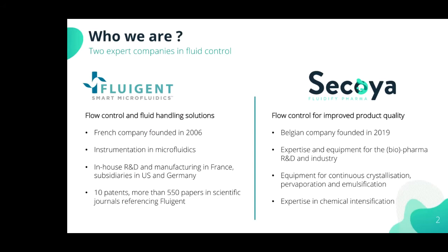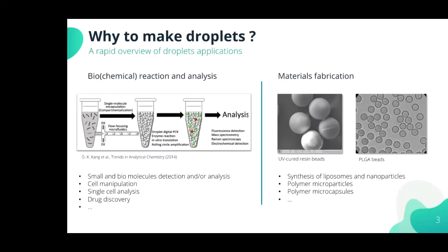But first, why make droplets? If you attend this webinar, you probably have an interest in droplets, and you probably have a specific application in mind. But each of you may have a different application, so I will just give you a rapid and non-exhaustive overview of such applications, sorted into categories: biochemical reaction and analysis, and material generation.